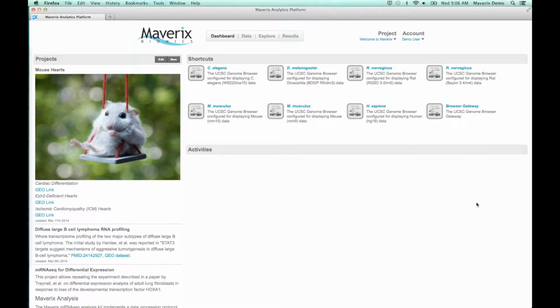What I'd like to do is give you an orientation to the platform, how to navigate around, and then I will go through an example of how to upload data and configure and launch an analysis on the platform. Then we'll go through some of the results and outputs from that analysis, as well as the data visualizations that you can use to explore your data. The final part will be to show the ease of our one-click solution to upload and transfer that data for analysis in IPA.